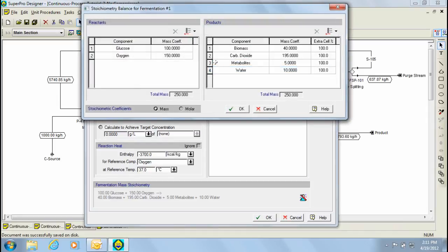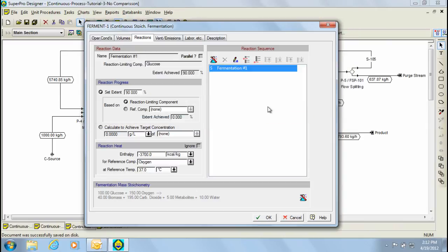The stoichiometric reaction was specified on a mass basis as glucose reacting with oxygen in order to produce biomass, carbon dioxide, metabolites and water. In this case, it is assumed that biomass is the product of this reaction and that the metabolites are byproducts which are inhibitory to the reaction. Furthermore, a reaction extent of 90% with respect to the reaction limiting component was used. Also, a heat of reaction of minus 3700 kilocalories per kilogram was assumed.